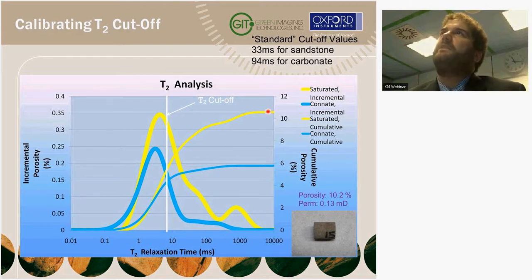What we want is for the cutoff value to represent the area underneath the yellow curve up to this line equaling the area underneath the whole blue curve, and that will be the cutoff. The trick people use is to go back to the cumulative until they hit the yellow cumulative and come down. But basically, it's the area underneath yellow up to the line equaling the area underneath the whole blue line, and that is the cutoff.